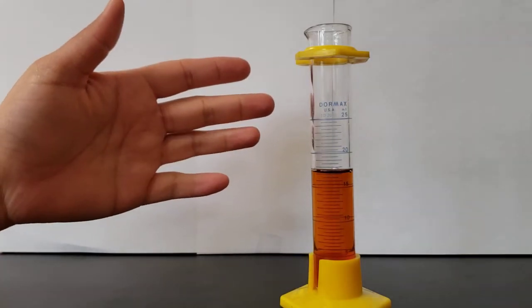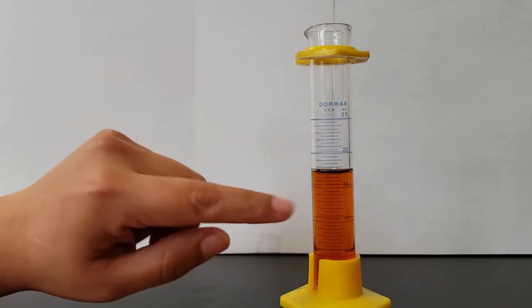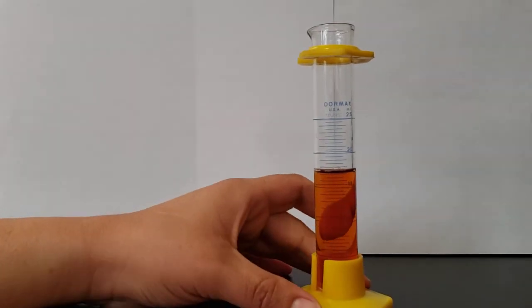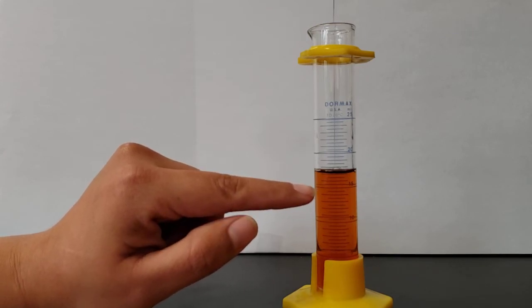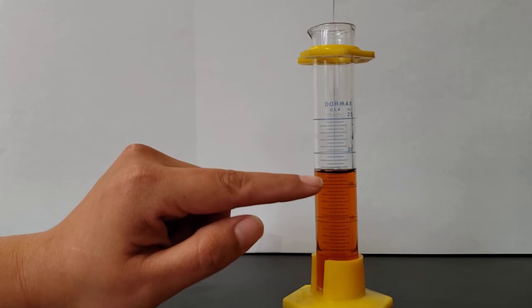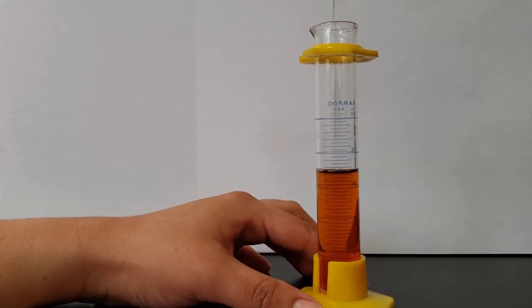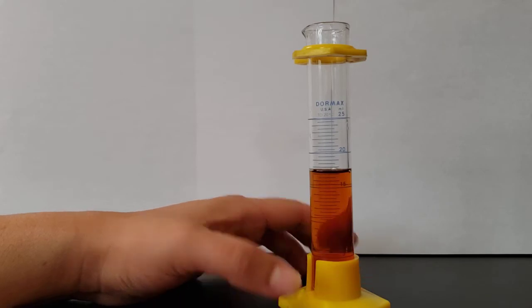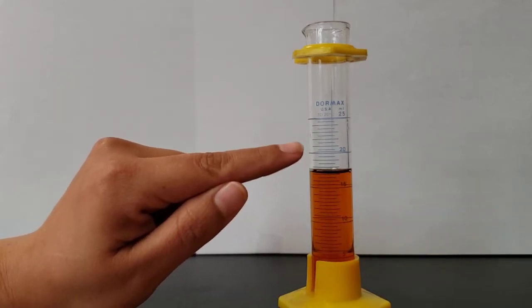We could take the opposite technique and we could subtract from 20, but here we're going to start at 15 and we're going to add to it. So looking down here, measuring again from the bottom of our meniscus, we can look and see that we are 1, 2, 3, 4 lines above the 15. And so what that means is that we're going to have to figure out how much each of these lines is worth. So if we look here between 20 and 25, we can see we can count 9 lines.